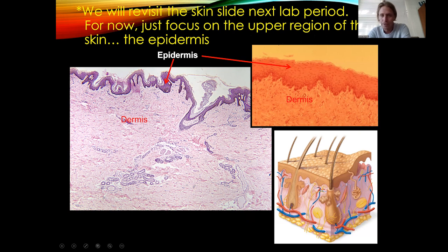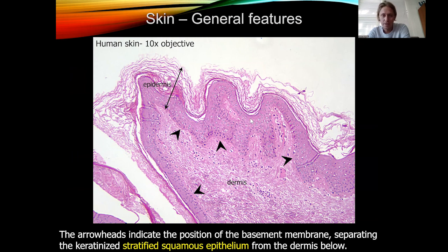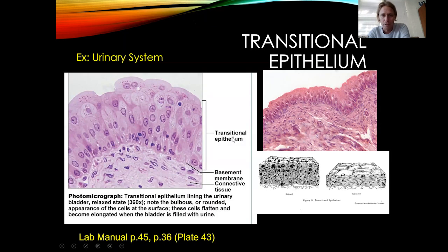All right, another image, just to give you an idea, just as a different stain. Again, stratification. Here's a really good example of that sloughing layer. This is the keratin that's left behind by the dead skin cells. That's what's falling off of you frequently. And then down here is the mitotic layer, which is undergoing mitosis frequently.